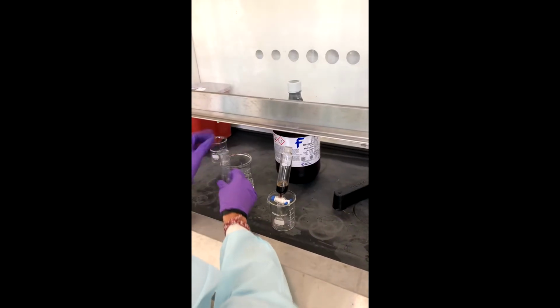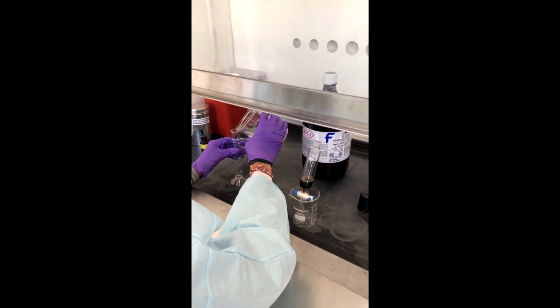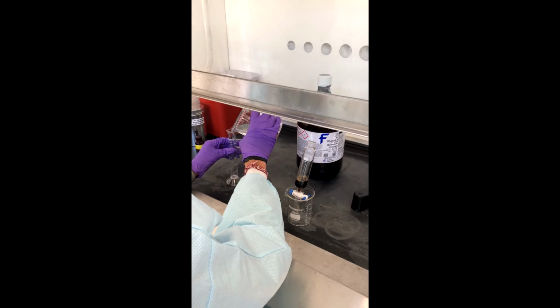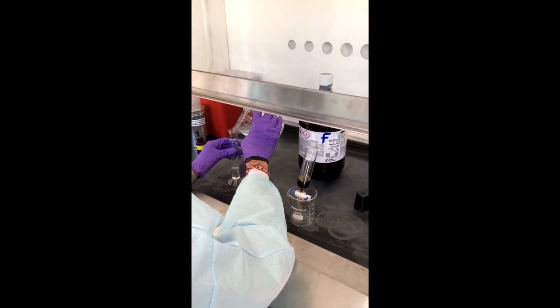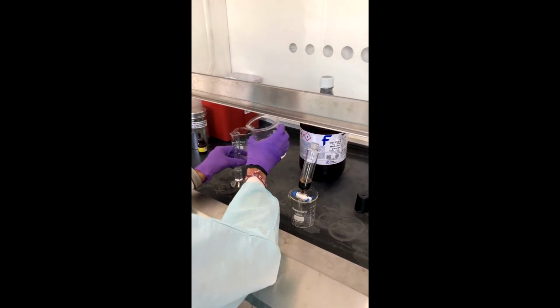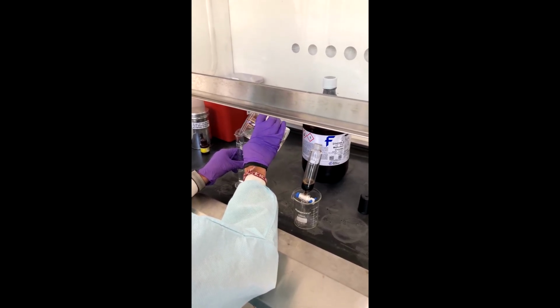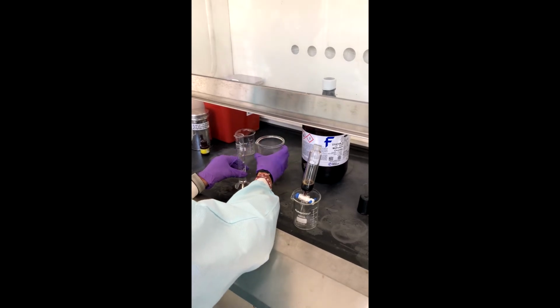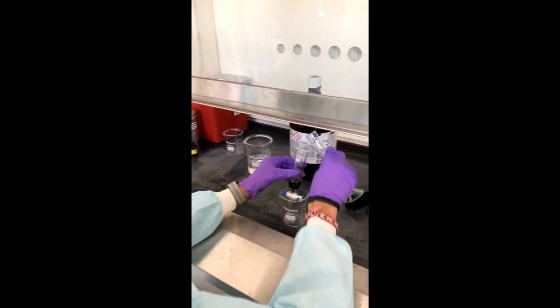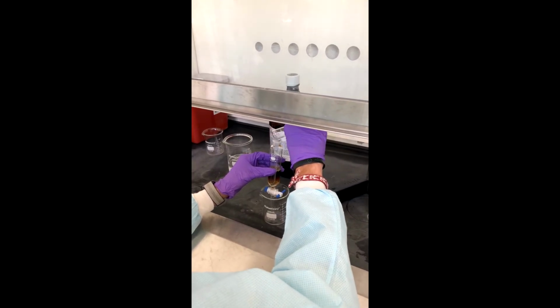Now that we've completed the solid liquid extraction portion of the lab, we need to move on to the liquid extraction portion. To do this, we're going to take the 15 milliliter sample of water with caffeine in it and put it into a separatory funnel. Along with this, we're going to put 15 milliliters of dichloromethane into that separatory funnel and invert it 3 or 4 times, which will allow the caffeine to move from the water to the dichloromethane, and then we'll allow it to settle with the water coming on top and the dichloromethane on the bottom due to the difference in density, making it very simple to turn the knob and allow the dichloromethane to flow out the bottom.